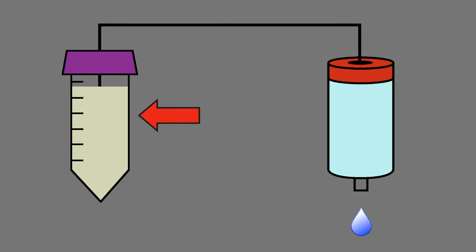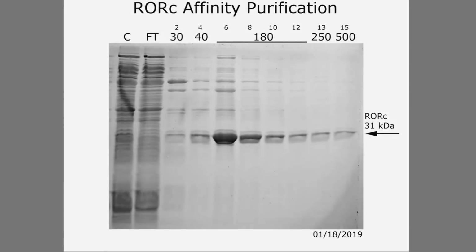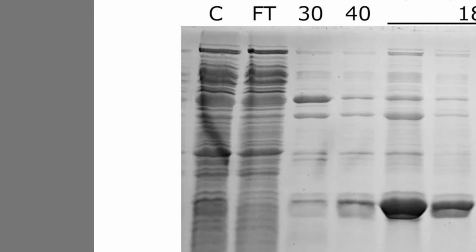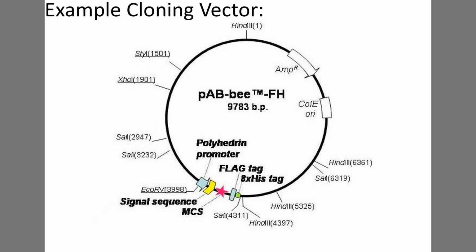The sample loaded into the column is now referred to as the crude, and the fluid running out of the column is the flow-through. Taking the crude and flow-through and running them on an SDS-PAGE should show an empty band on the flow-through when comparing it to the crude. This simply demonstrates that our protein has successfully bonded to the column while the majority of bacterial proteins have been washed out. The selective binding is no fluke, but rather some exceptional planning at the cloning step.